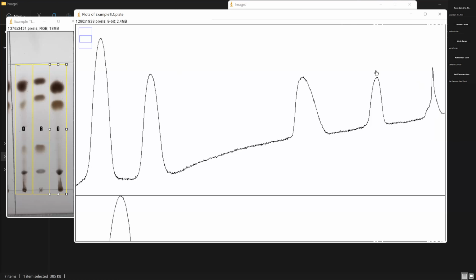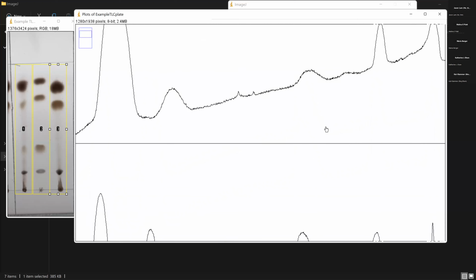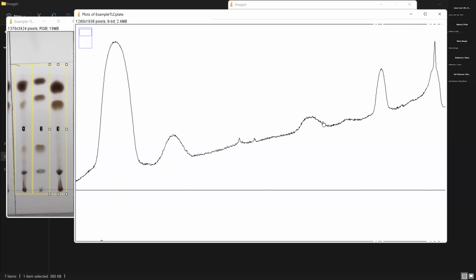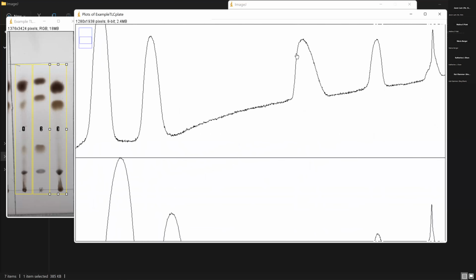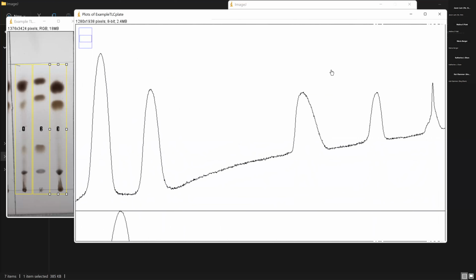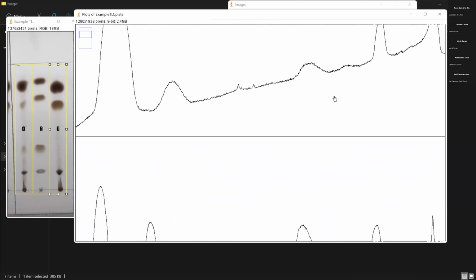With this standard chromatogram, we can also help identify and confirm that this top chromatogram is actually the HDL, because you see right here there is a peak for fatty acids, because it corresponds with the fatty acid peak in the standard. And there is no fatty acid peak in the pellet. This is what we expect. Do any of you know why that is the case?